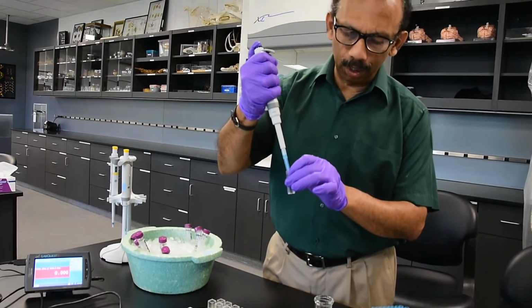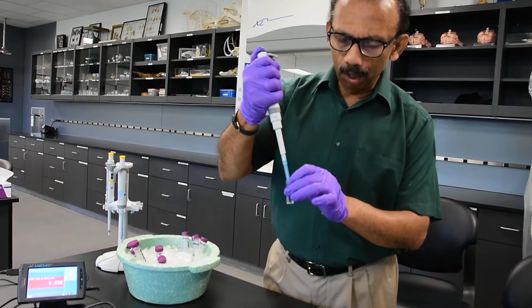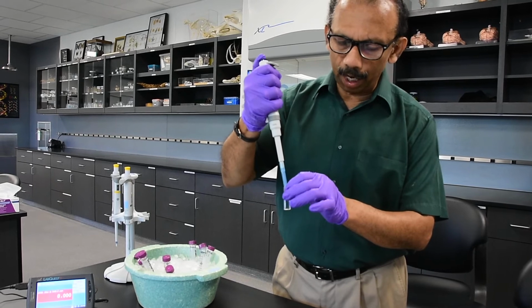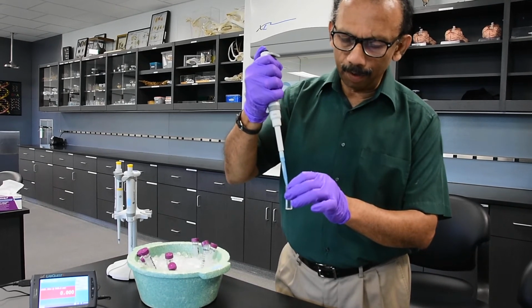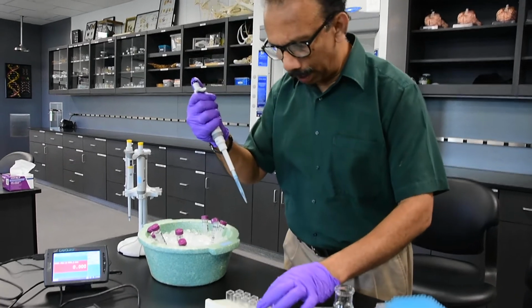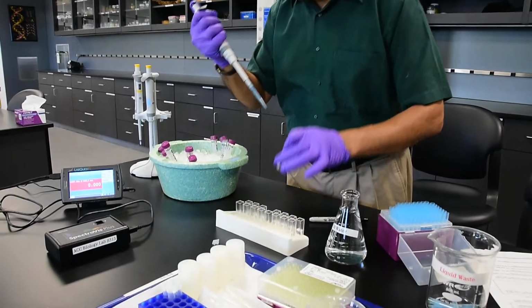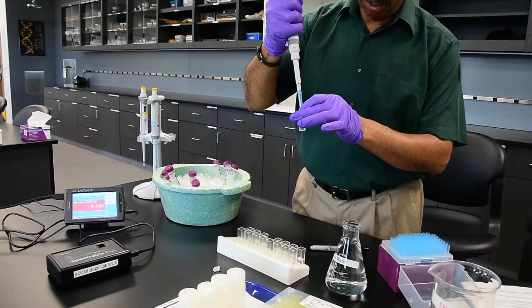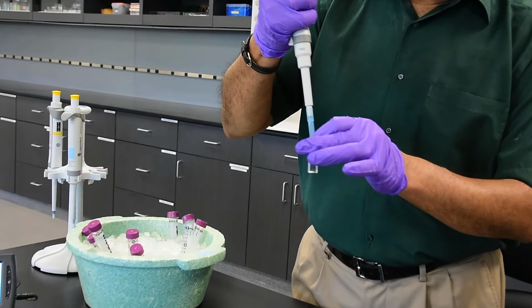So you are doing this in a sequential manner, and the concentration at each stage becomes half, and the dilution is 2x. Okay. So we have the 4th concentration done, and I'm doing the 5th concentration and mixing it well.